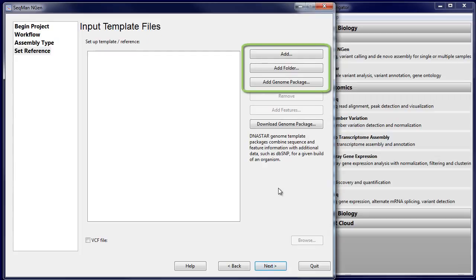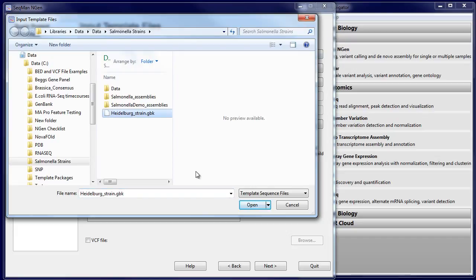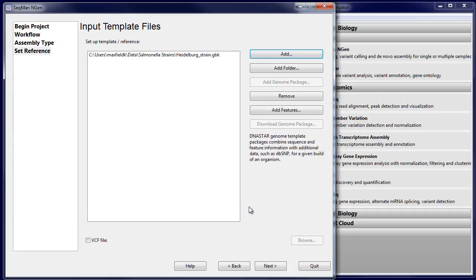Next, load your reference sequence or genome template package. For this example, we'll be assembling multiple salmonella strains, and I'm going to use the Heidelberg strain GenBank file as my reference sequence.